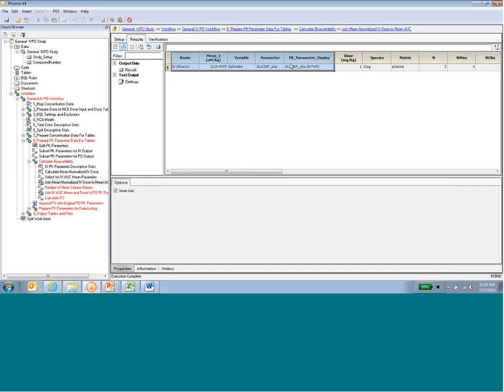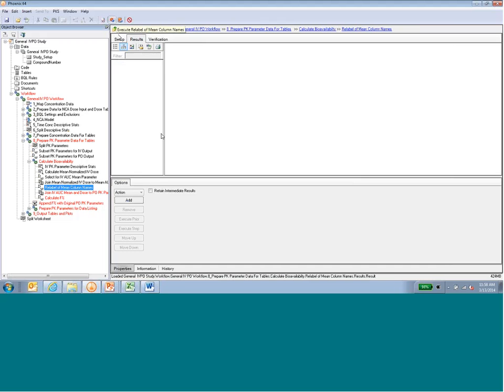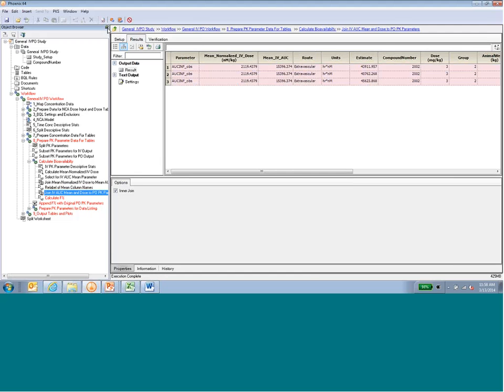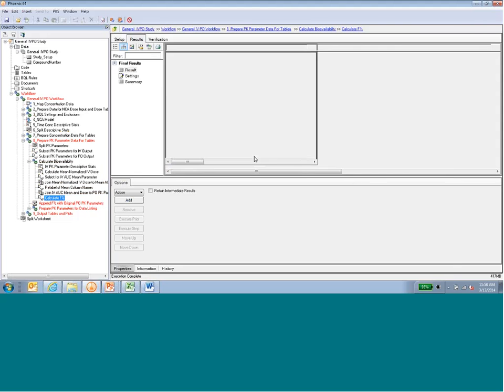So what happened is we have one worksheet here that includes the source data, and then the second bit was from the descriptive stats. So you get the original, you get the mean from one worksheet, and then the descriptive stats from a second worksheet. And you notice here that these outputs have turned pink. That's just to let you know that a previous step was executed. It's very easy to just re-execute everything and refresh your analysis.